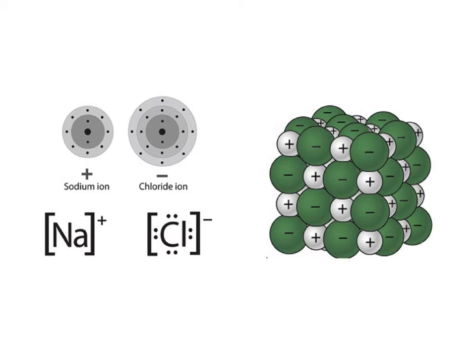The first solvent that you used was really an aqueous solution where we put a little bit of sodium chloride into the solution to accentuate the polarity of that solution.